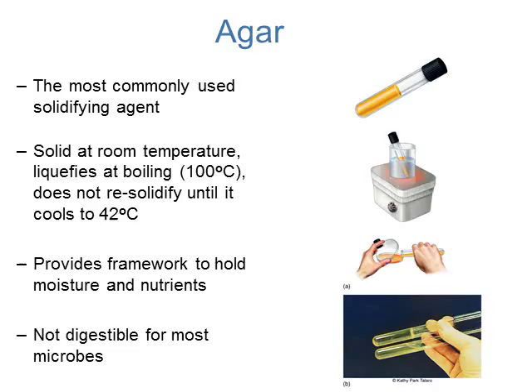So we're using mostly semi-solid media in the form of agar. This is a commonly used solidifying agent. It's kind of like gelatin. Agar is solid at room temperature, which is convenient. It liquefies at boiling and above, so you can heat it up, you can liquefy it, you can pour it into a plate, you can pour it into a tube and cause it to solidify at a slant. And it re-solidifies at about 42 degrees Celsius. So as it cools, it solidifies.